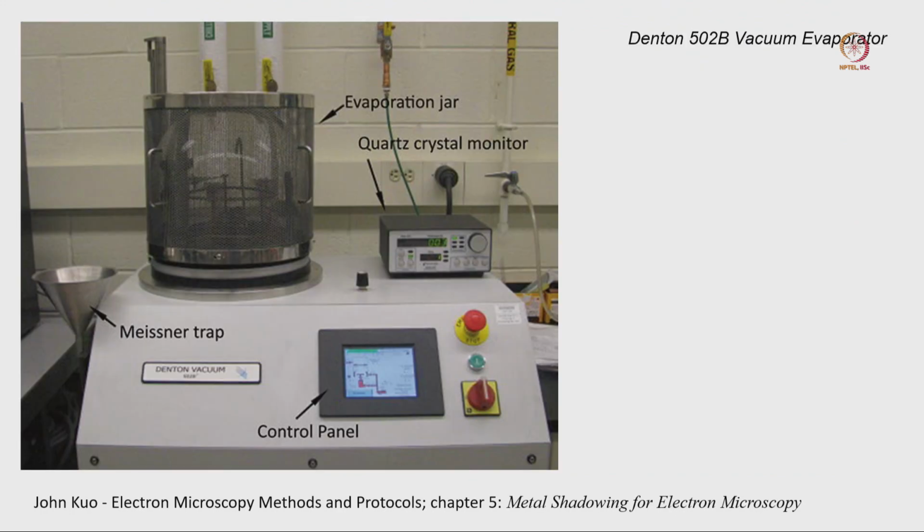If you look here, there is a similar kind of equipment we are using. Most of the time the carbon coater we are using has a facility that we can use for metal shadowing also, or coating our grid with the metal ion. If you remember, initially I was showing a gold grid. A lot of the time we can use a copper grid and coat it with gold, or you have a carbon coated grid with a biological sample on top and you want to coat it with platinum. Most of the time we use a similar apparatus as a metal coater as well as a carbon coater, so there is a dual facility. In some cases that dual facility will not be there.